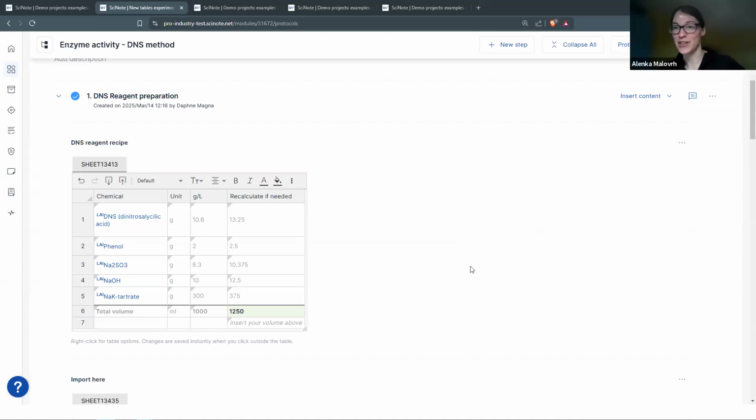And if you can share your use case and why, that would also be pretty helpful. Is the reason that you have a large table, or is it some other reason why you would want this feature? That would be very helpful for us in the product team to understand the reasons behind this feature in order to know why we should introduce it for you.